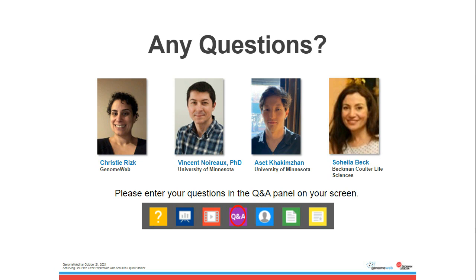Thank you. And Sohaila, I believe the next question is for you. Does Echo have any temperature controls when samples are being deposited on the plate? And are TXTL components stable at room temperature? And if so, for how long? I'm going to take the first one and pass the second one, in terms of the TXTL reagents being stable or not, to Aset and Vincent.